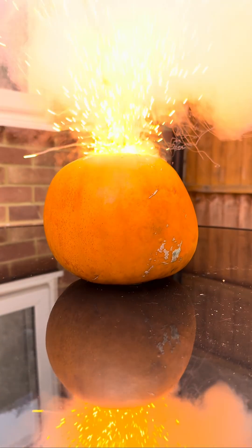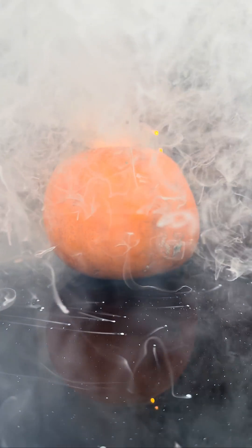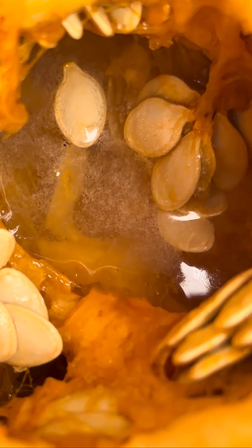The sodium reacted with the vanillic acid inside the pumpkin to form sodium vanillate. Obviously the sodium also reacted with the water to form sodium hydroxide — that's the alkaline, very corrosive stuff. Pumpkin's done out here.